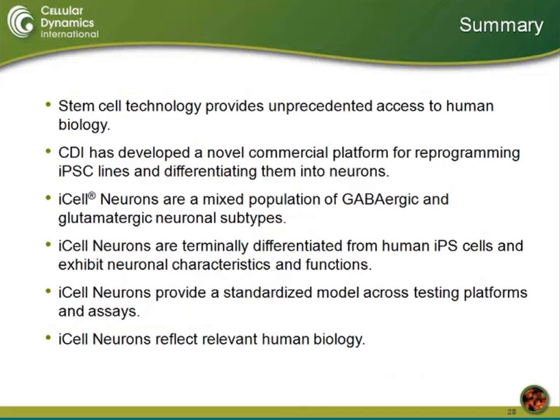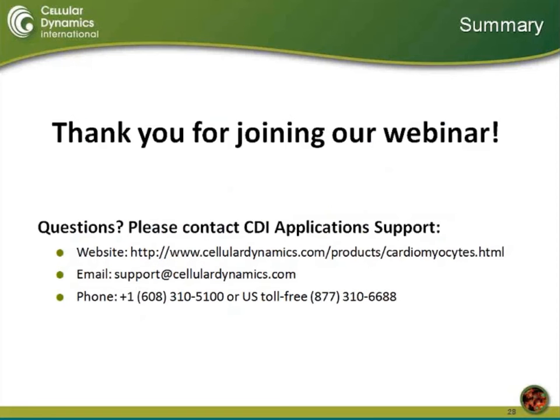And finally, in some of our functional characterization of the cells, we assess the electrophysiology of the cells by single-cell patch clamp analysis. And what we're seeing here is that iCell neurons are able to generate, and we're able to record, both evoked and spontaneous action potentials off of our cells. And we have a very nice mature-looking action potential here with the depolarization to 0 millivolts and then back down to the resting membrane potential within a repolarization.